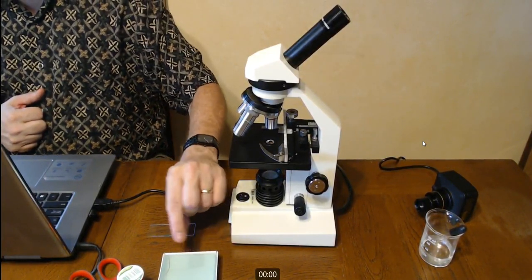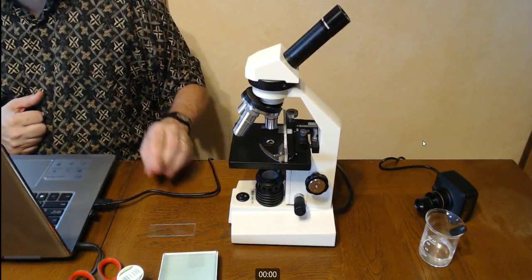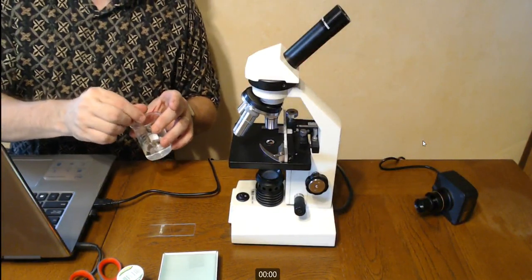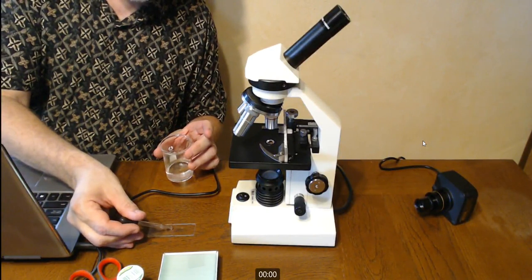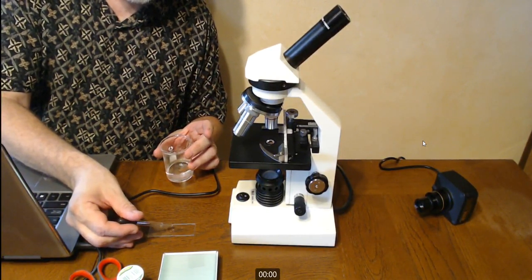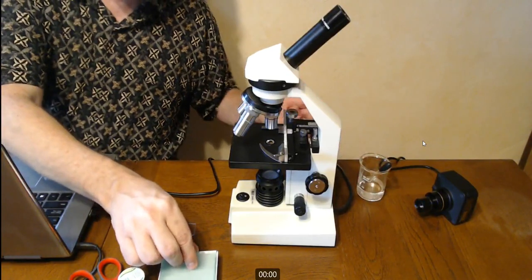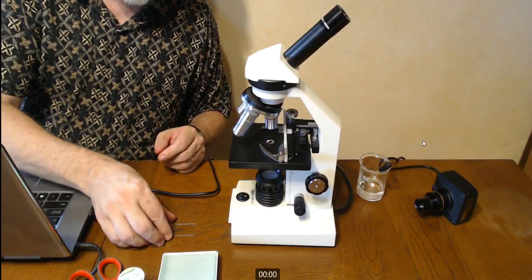So what I'm going to do is take my thread and lay it across about the center of my slide. Then I'm going to take my water and my eyedropper and put a big drop of water right in the middle. The water makes everything a little more optically stable, although you will notice sometimes you get bubbles.